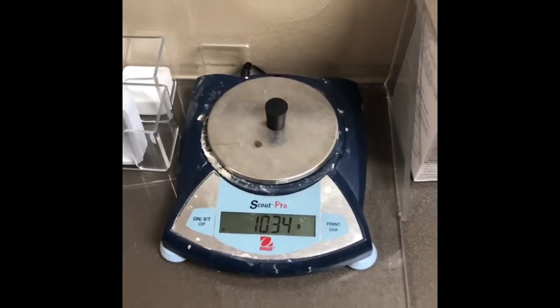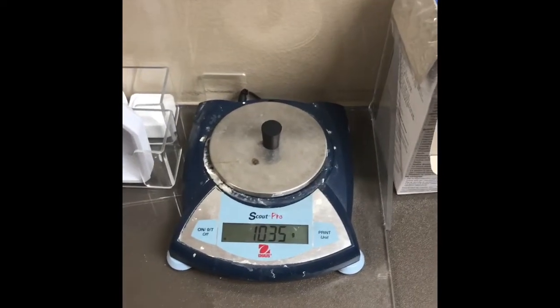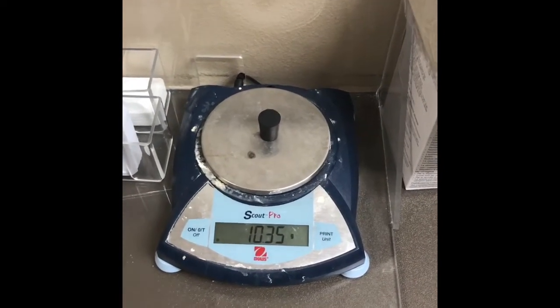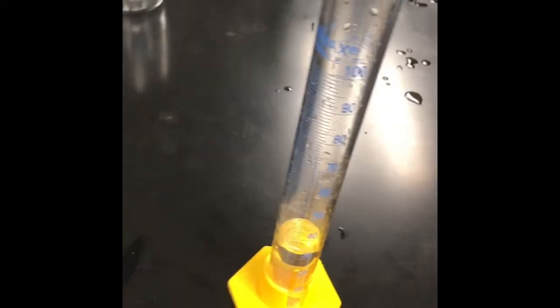Okay, so the next part of the lab deals with finding the density of a rubber stopper. In order to find the density of a rubber stopper, we've got to find the mass first. It looks like it's got a mass of 10.35 grams. The next step was to measure out 30 milliliters of water.